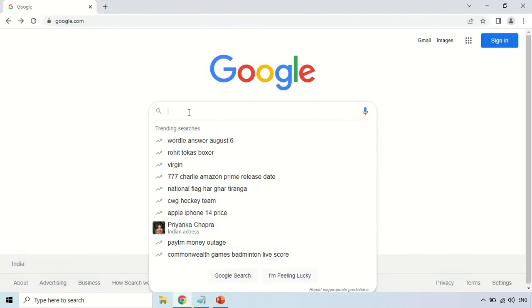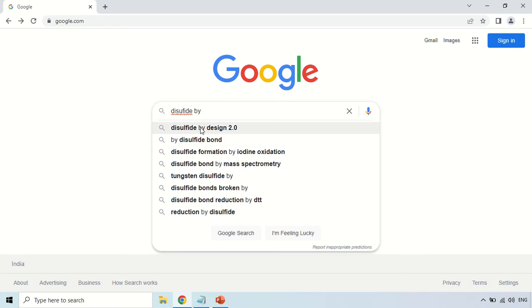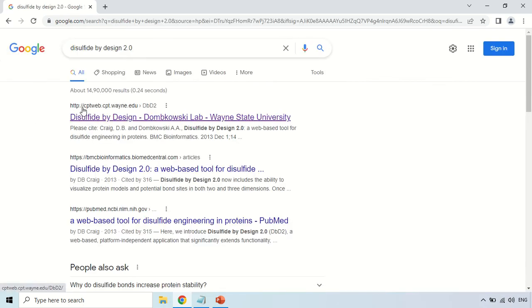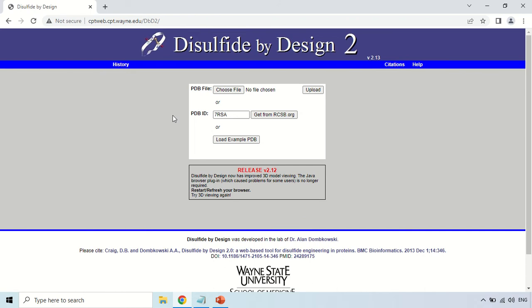To access this tool, open your browser and type 'disulfide by design tool'. The website is cptweb.cpt.wayne.edu — just click there. This is the home page of the tool. Here you can enter your data by three options: you can choose a PDB file, upload it using the upload button, search by PDB ID, or load the available sample files.